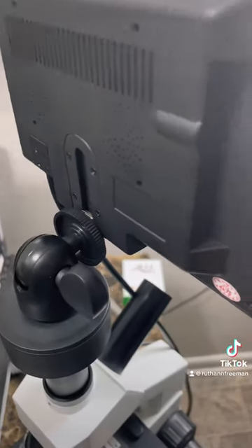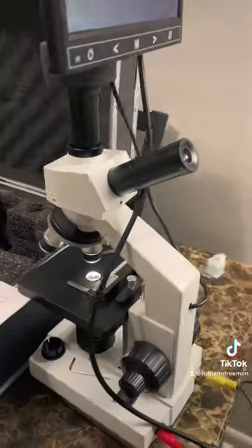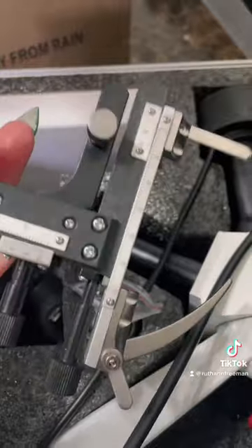The biggest selling point for me was the viewing screen, so it would be easy to show my followers my findings — and the screen didn't work. We could get it to turn on but it would never show an image. This part was originally covered in what felt like sticky grease, and at this point I realized this microscope might have been refurbished.